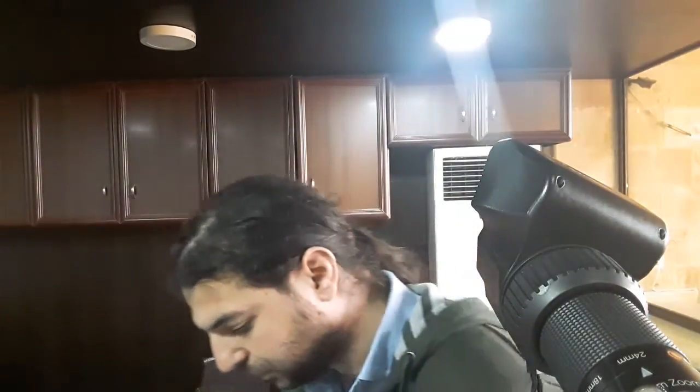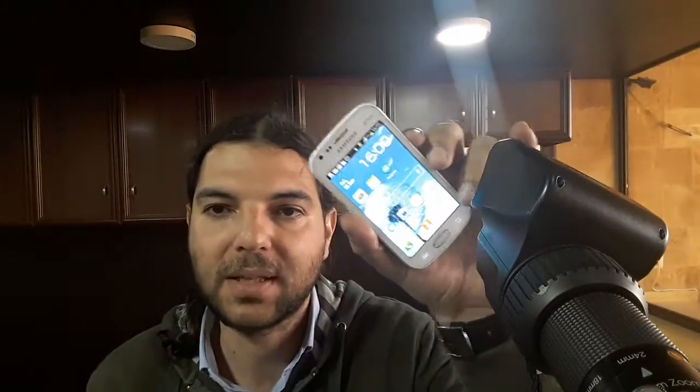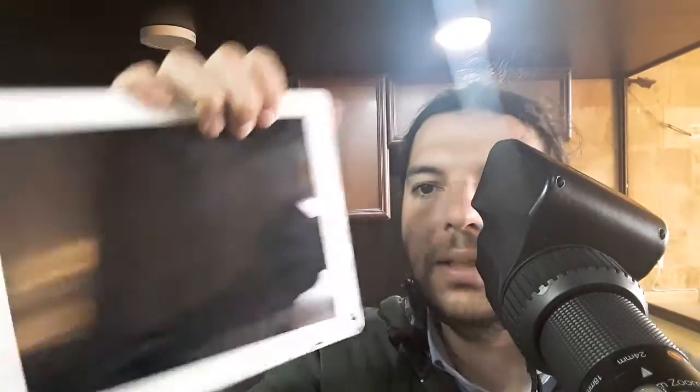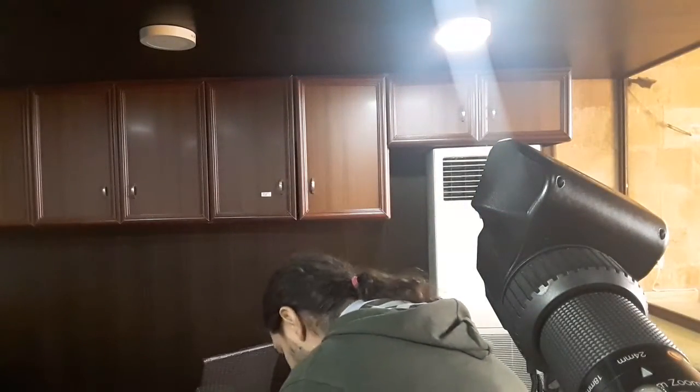This is a Wi-Fi camera and a USB camera at the same time. I have an old Samsung Android phone and also an iPad, which will also have a copy of the software you can run to see the contents of the camera through the telescope.